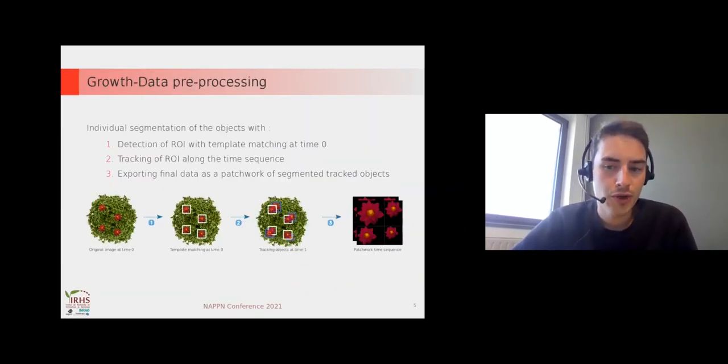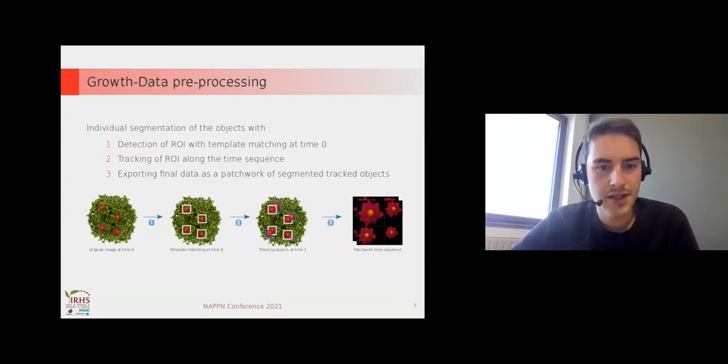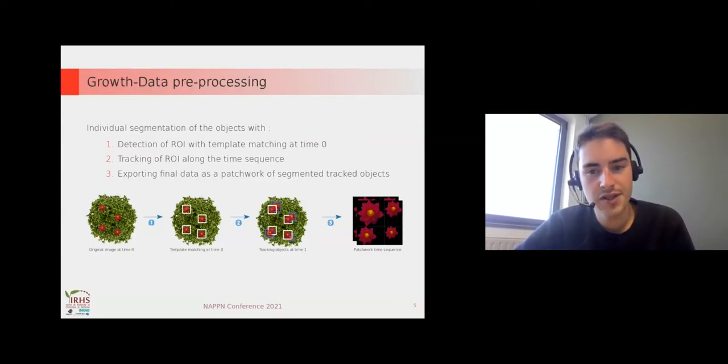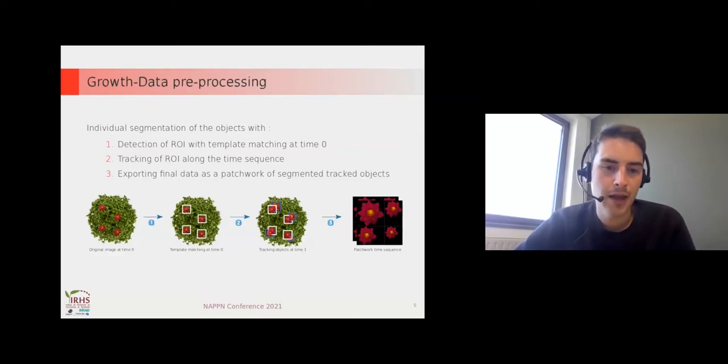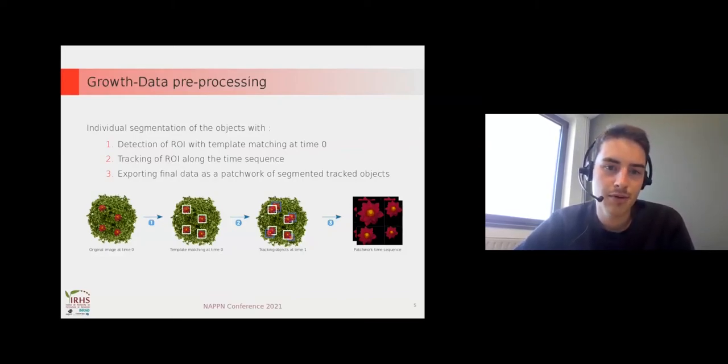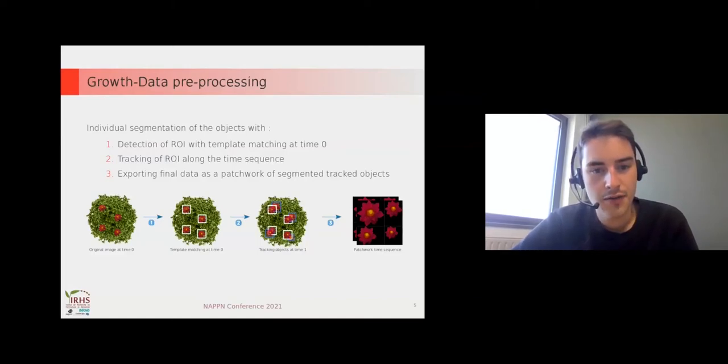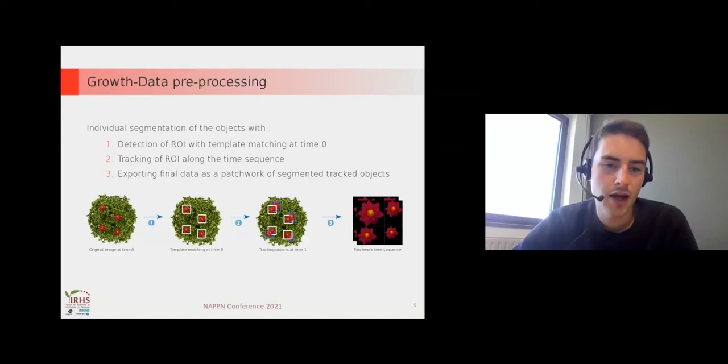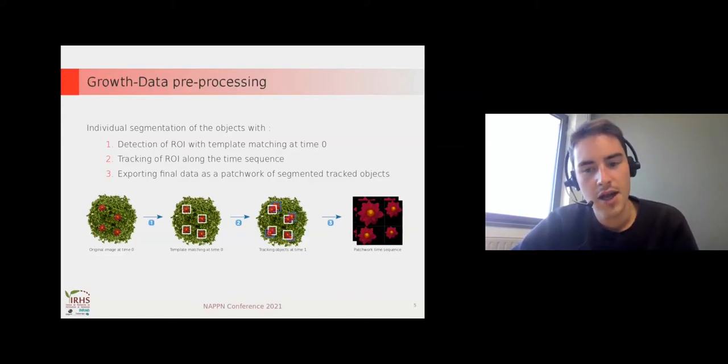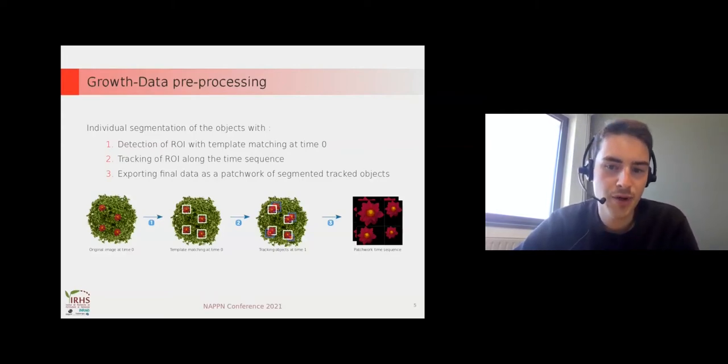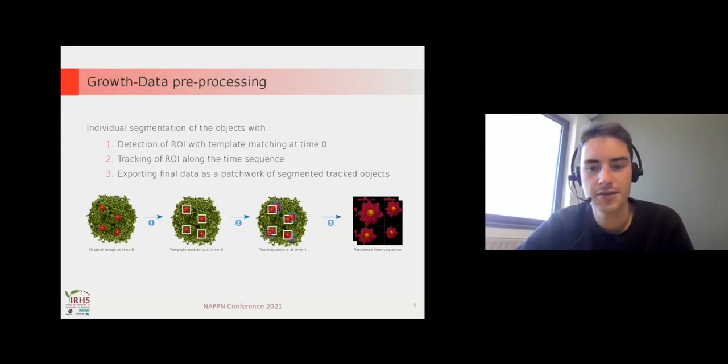To use the app growth data we have to do some pre-processing. The first step is to detect the region of interest with template matching at time zero. After that we track the ROI along the time sequence. And finally we export the data as a patchwork of segmented tracked objects.